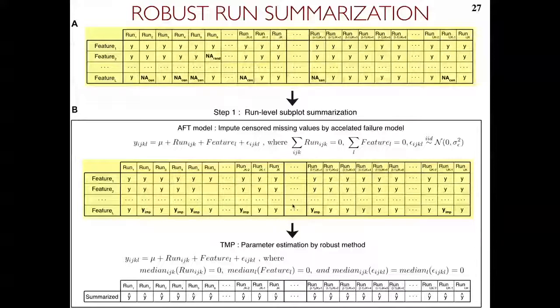Yeah, I see what you're saying. So that will actually be part of the converters. We never let into this step features which have missing values almost everywhere. So the converters will have additional filtering steps. And in fact, I will talk about this in just a minute. We have filters based on Q values of identification. You can have filters based on other criteria, right?